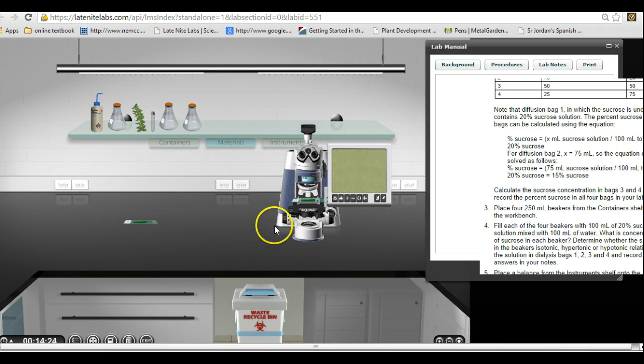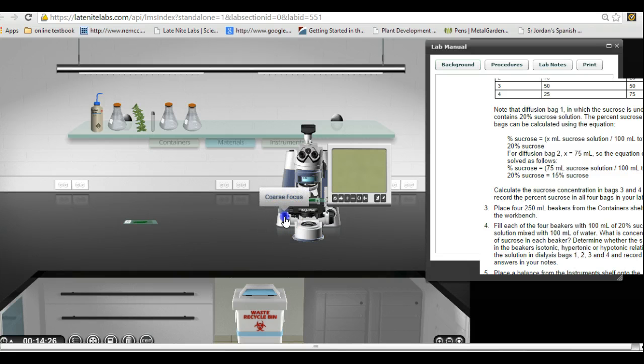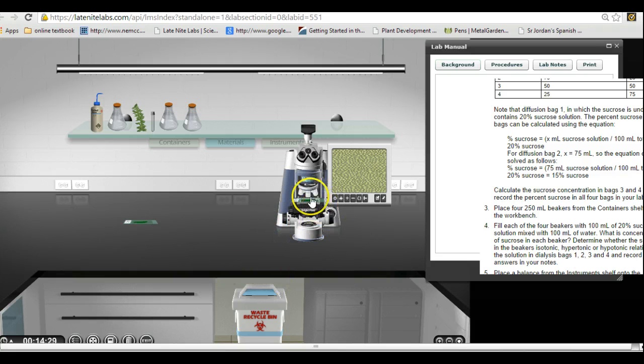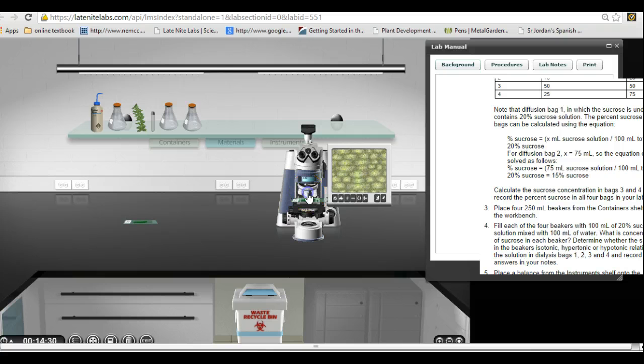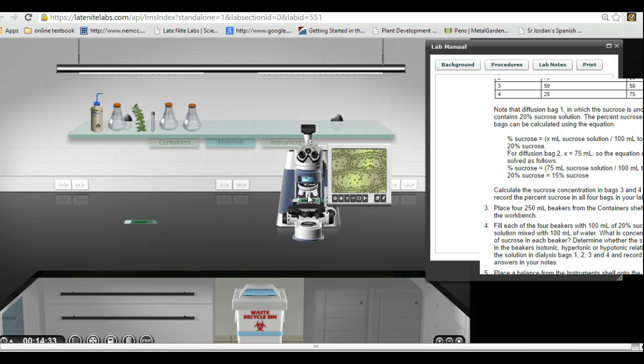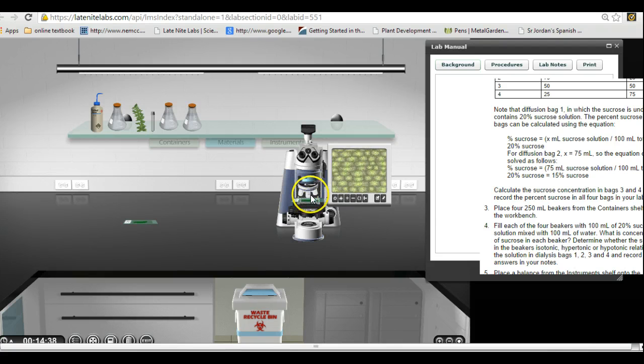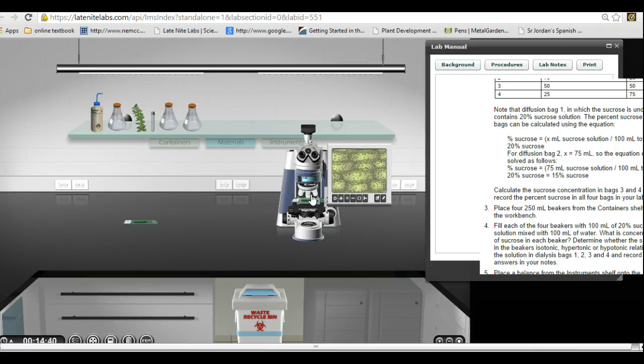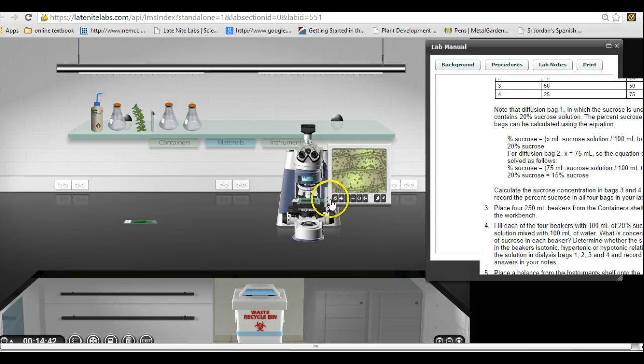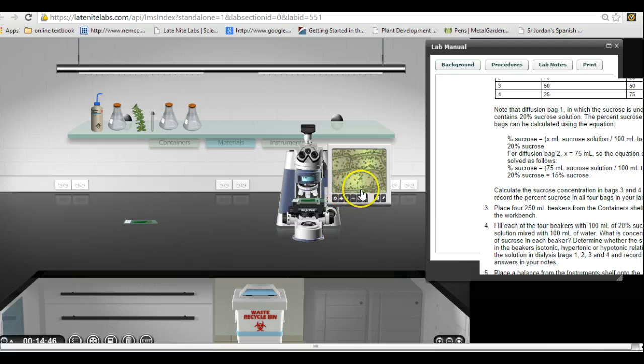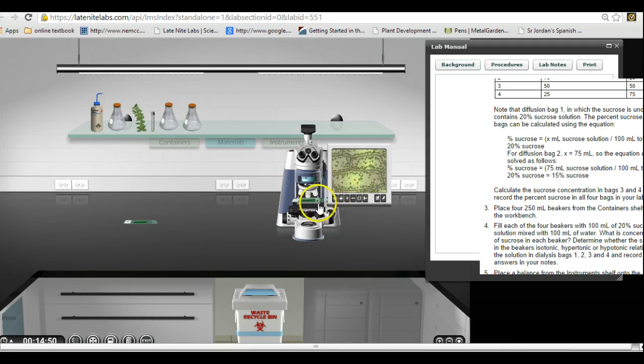There we go. Now it's out of focus. I'm going to focus the scope. There we go. I'm going to change objectives, and that looks pretty good. Let's go up one more. Nope, I took it back. There we go, that looks pretty good.